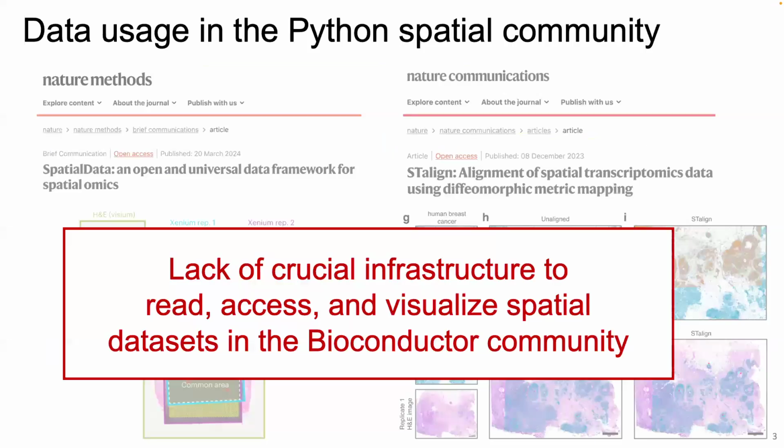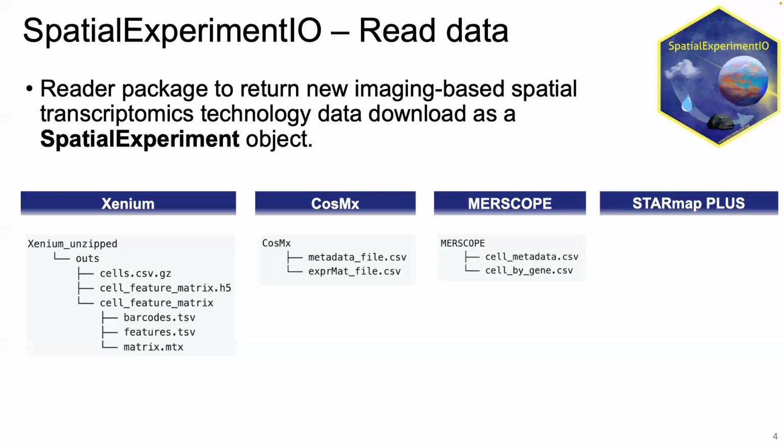So previously in the Python community, we have spatial data now. We also have ST-align to register these different slices. We do have a gap in Bioconductor for reading, accessing, and visualizing such data. So now we fill the gap by having these three tools.